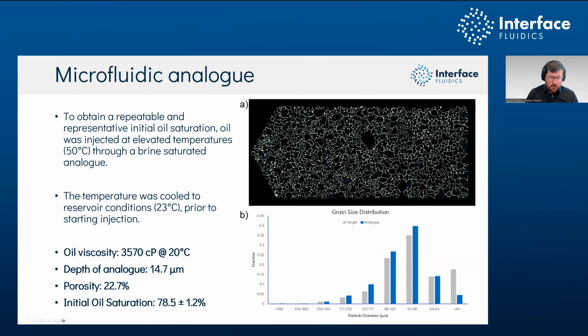So as I said before, getting a custom reservoir analog that is designed to replicate their system is extremely important. We spent a lot of time up front obtaining data in order to create this representative porous media that you can see on the screen here, and it has a fairly significantly different look to the ones I've shown you previously.